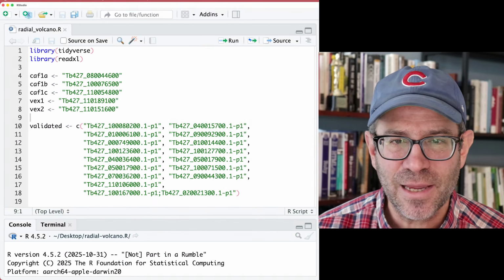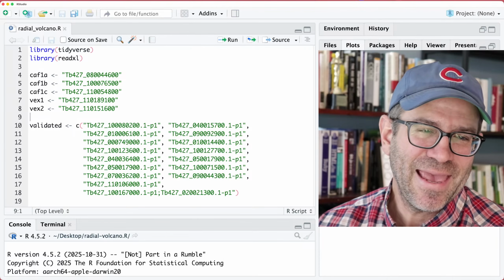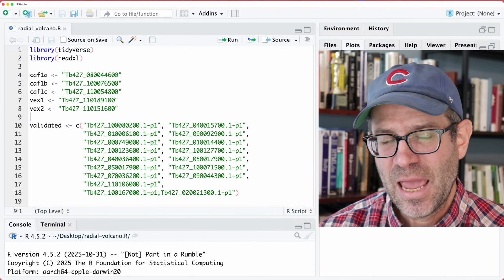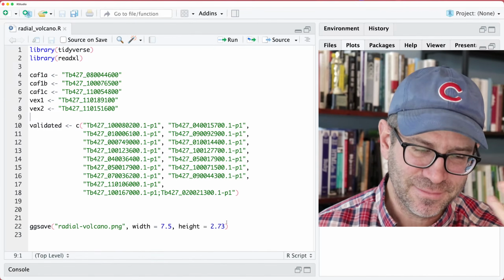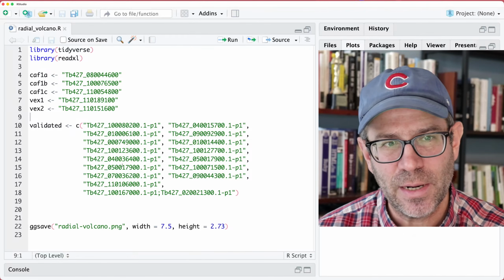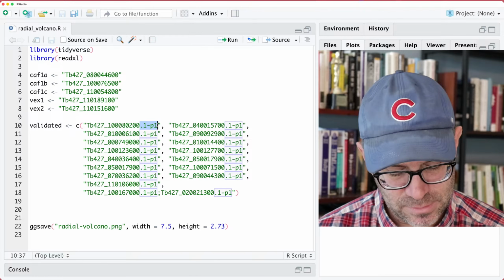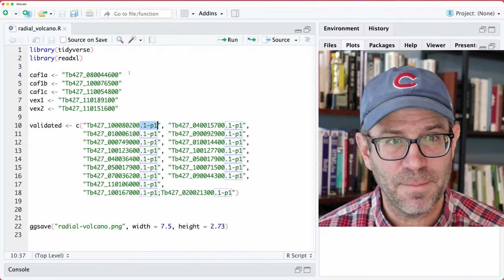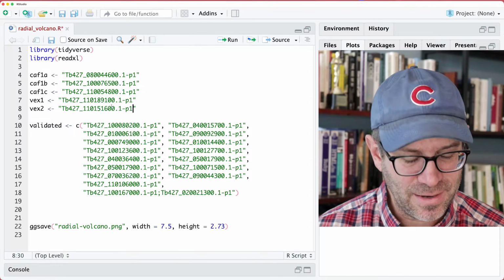I am slightly concerned that I have bitten off more than I can chew in doing this data visualization. And so I've been doing a little bit of background work to get going on it. One of the things that I've already done, because it was kind of hard for me to figure out on my own, frankly, was what are the genes that are purple in the plot.